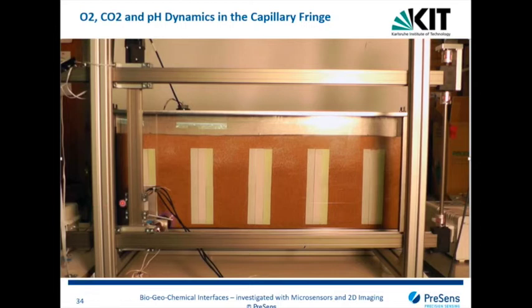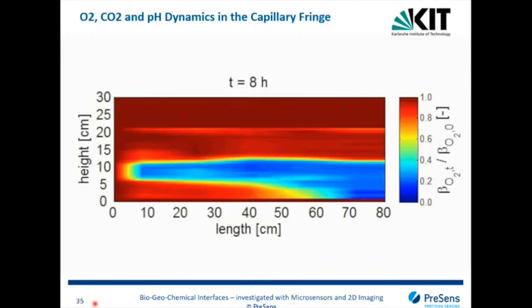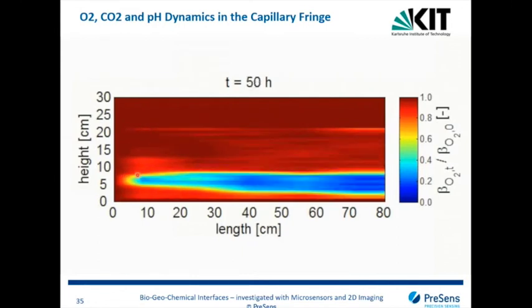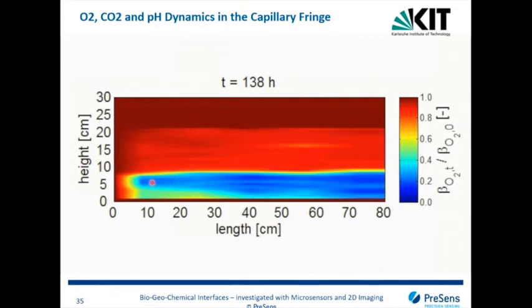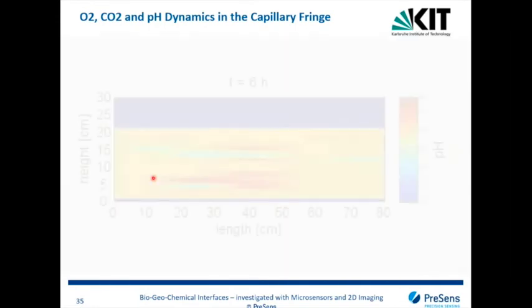Here on the left side, there was an inlet where an organic model compound went in, and the microbial reworking of the model compound, and respectively the respiration, was investigated in this system. Here's a short video of how that looks. So you have the inlet of the organic model compound in here. The microbes start reworking the compound, causing a drop of oxygenation because they respire. And so you also have these hotspots of microbial processes taking place in here.